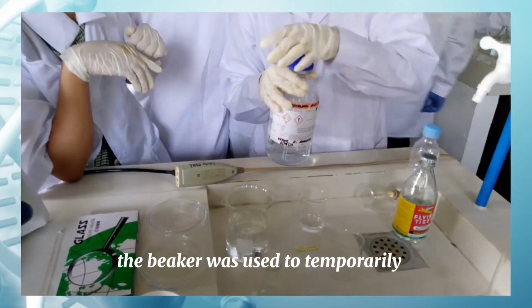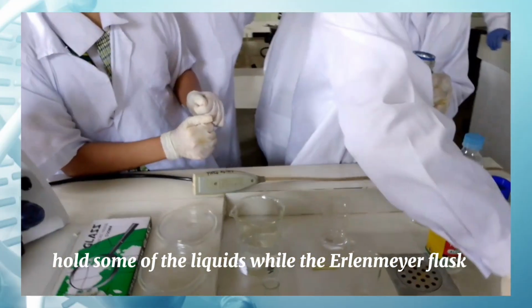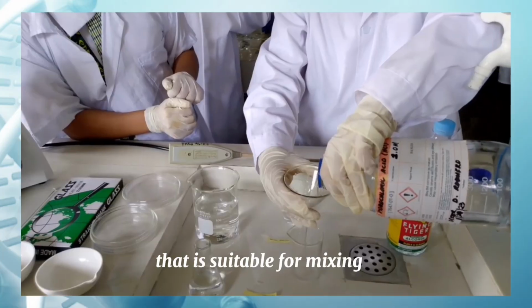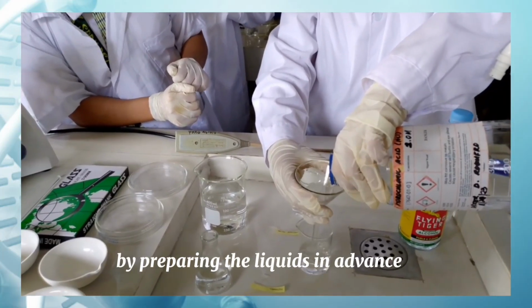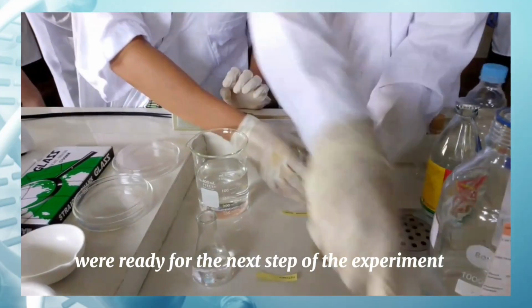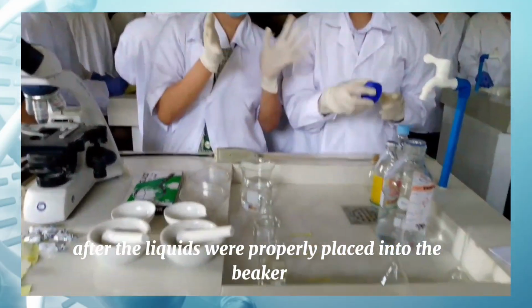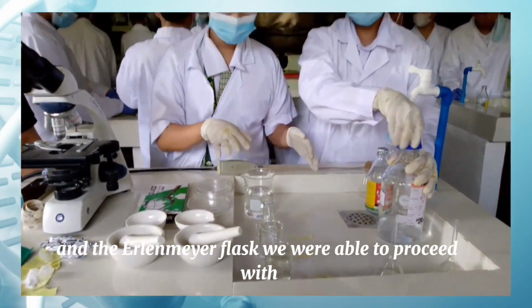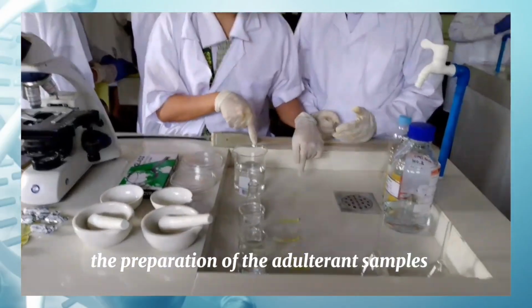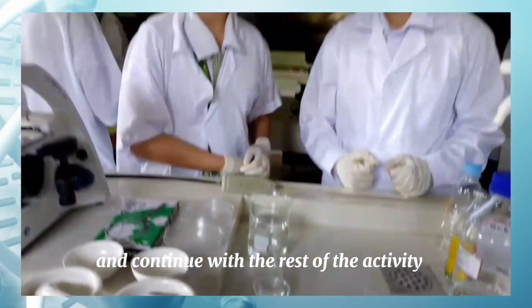The beaker was used to temporarily hold some of the liquids, while the Erlenmeyer flask helped contain the solution in a stable container that is suitable for mixing. By preparing the liquids in advance, we ensured that all the materials were ready for the next step of the experiment. After the liquids were properly placed into the beaker and the Erlenmeyer flask, we were able to proceed with the preparation of the adulterant samples and continue with the rest of the activity.